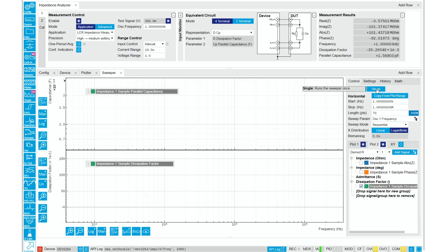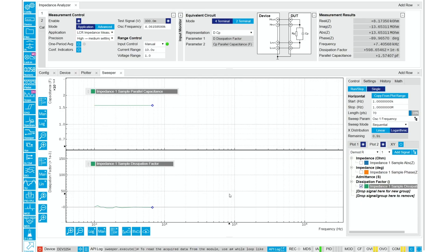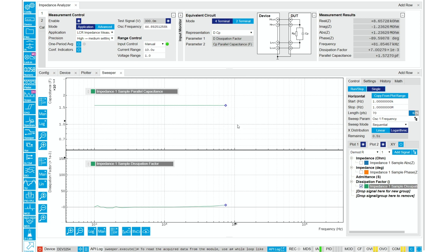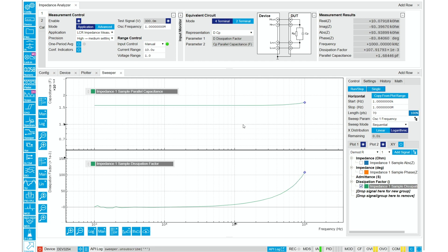Using LCR mode, we can get the dissipation factor directly. For the relative dielectric constant, we need to further normalize to the electrode area and thickness from this measured capacitance.